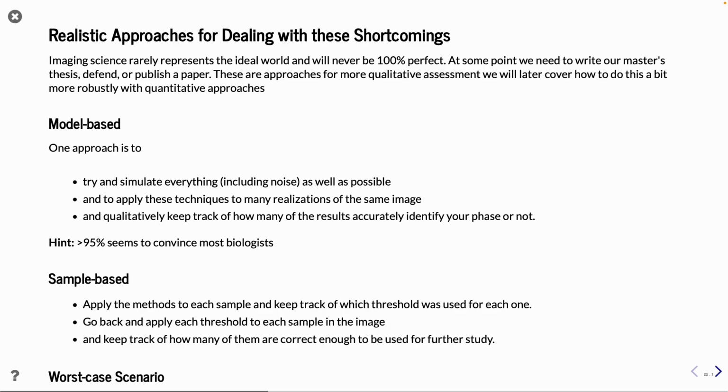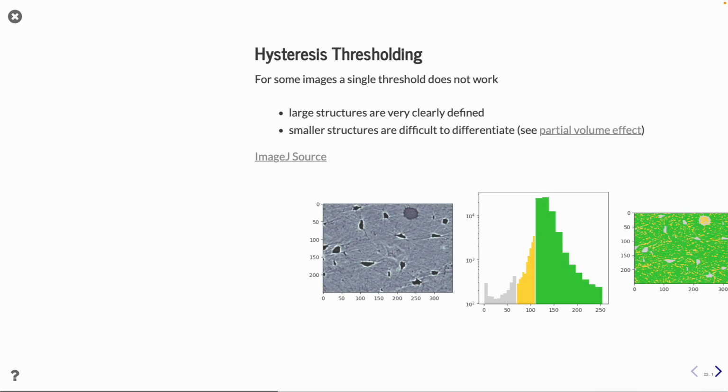Worst case scenario is not shown here, but there you also have to go into more statistical approaches and say that you have to reject when they are not statistically sane. So you just take the middle quantile of the results. That's a fallback version, but I would say in the worst case, you should probably rethink what you had done and instead try to find a better method.